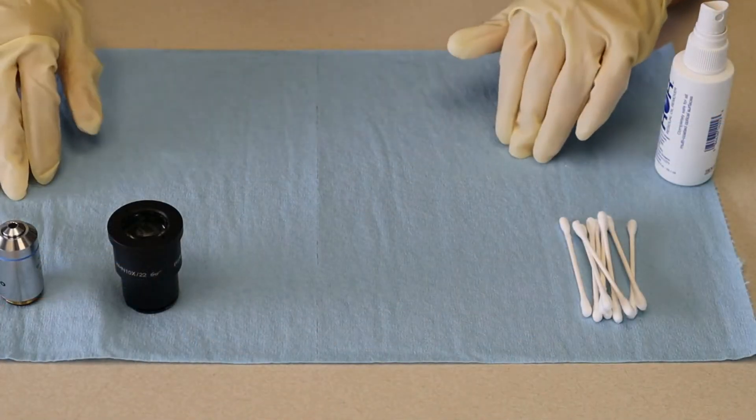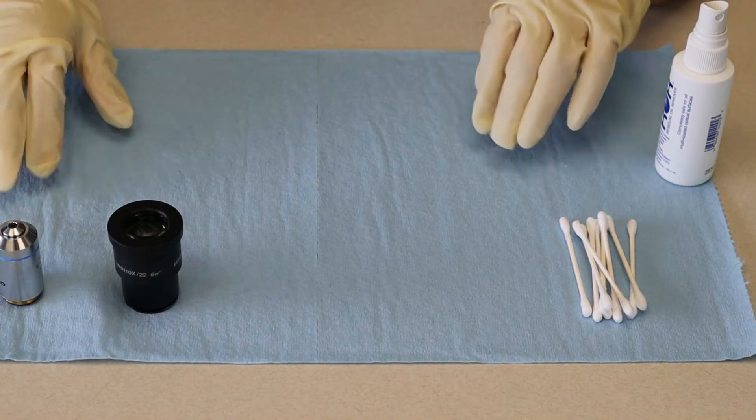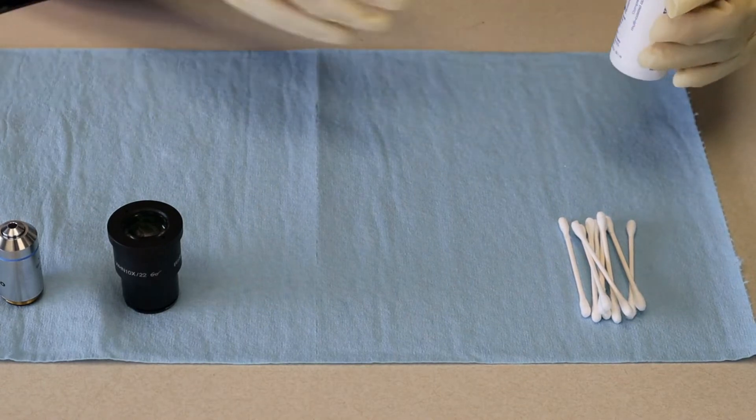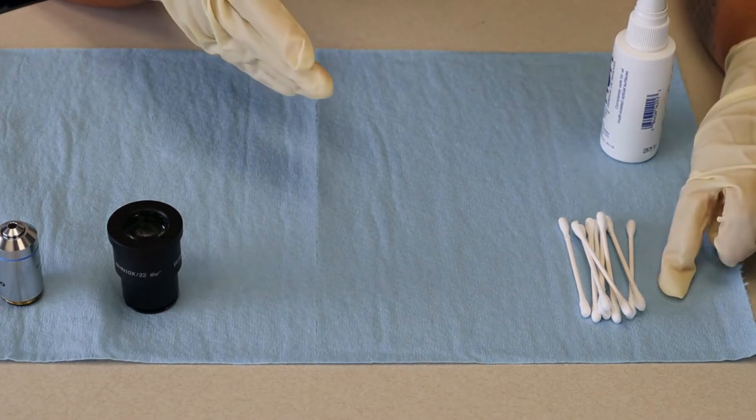Okay, so we have here a paper towel that's just going to help keep the surface clean, and then we have our ROR lens cleaning solution that we're going to use and then we have a few cotton swabs.